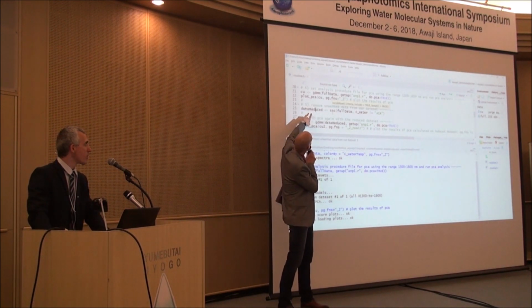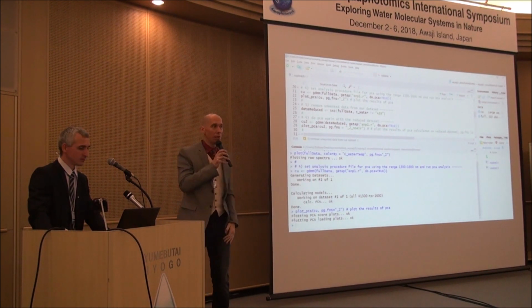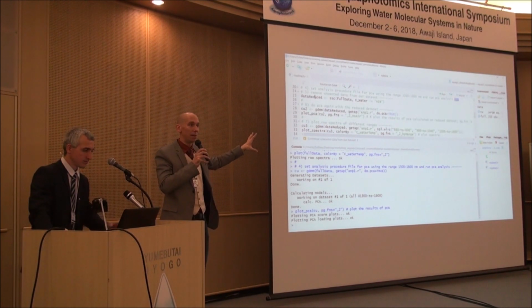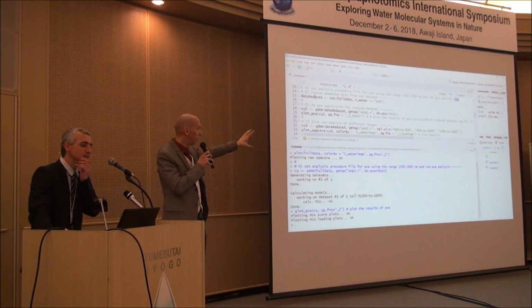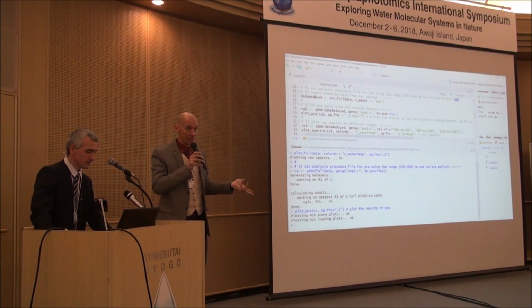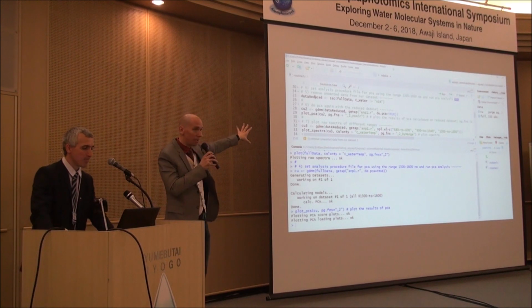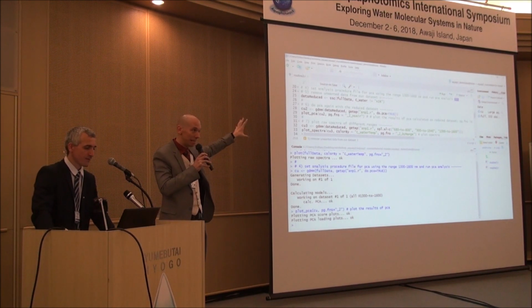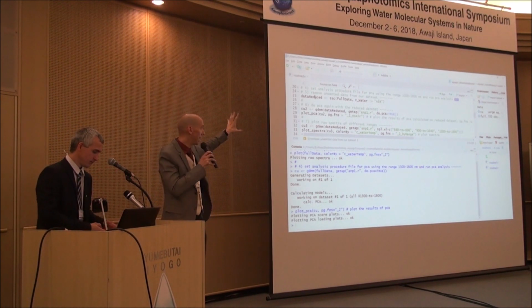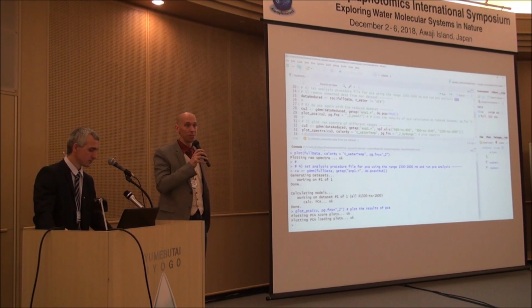Okay, I was using the function called GDMM. Then you have to look it up. Okay, what does it do? And from this template, if you learn how to work the program, you can then find out how to analyze your data. So this is just an example we give you to give you a first hint and saying that it can work, it does run, it can do things, and you have to look at the code, study it, read the help manual, understand. If you really understand what is happening here, so my suggestion, first you understand exactly what is happening here. Once you do this, then you can use it for your own purposes.